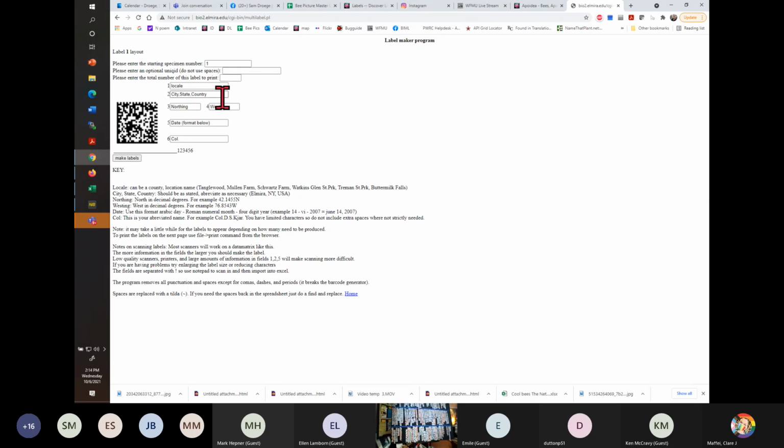I've just got a giant foam board of pre-filled out det labels. Otherwise, what people do is they have the same label. You don't want it very big, and you want to use a 0.01 or 0.005 technical pen to write and learn how to write very nicely, which was a struggle for me, and print it neatly. So you're just going to write out your det labels.